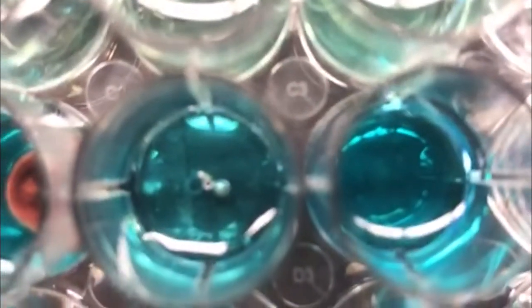Okay, so next up, I've got these 4 pieces of metal. This is metal B, or unknown number 2. I'm going to put drops of this into each solution. That's metal B in water. Nothing really happening there. B in the copper chloride, nickel sulfate, and the zinc solution.